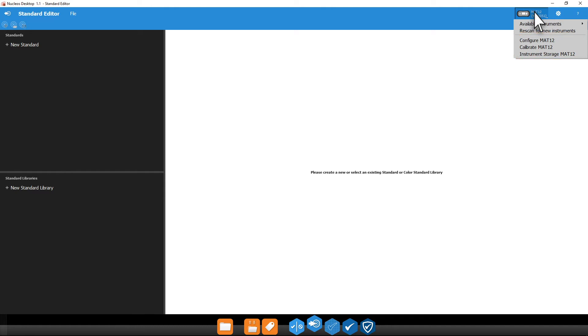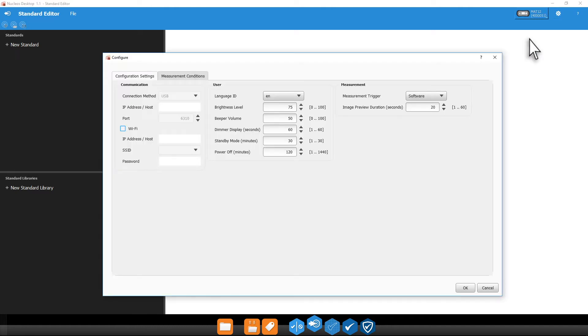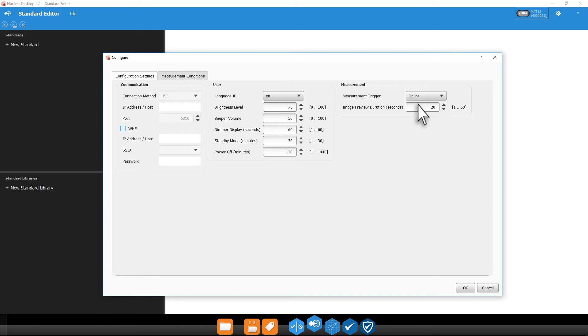The instrument configuration settings will most likely mirror the same settings on your device. There are a couple of additional options worth taking a look at. Measurement trigger can be set to online or software. Online allows you to trigger a measurement from your device rather than inside the software. This can be useful in situations where you may not have a free hand to trigger the measurement in the software.